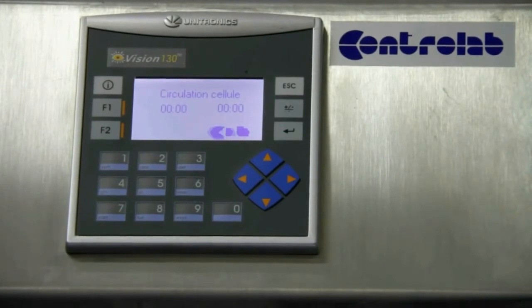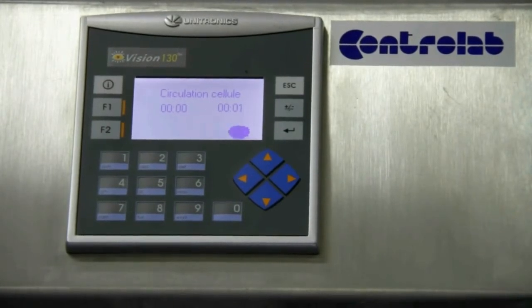The stopping of the test is automatically done and the unit displays the value of the methylene blue value.